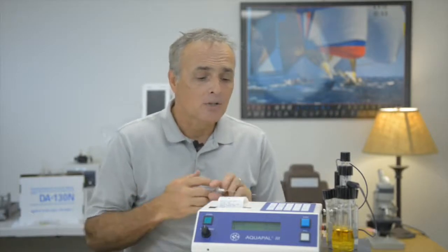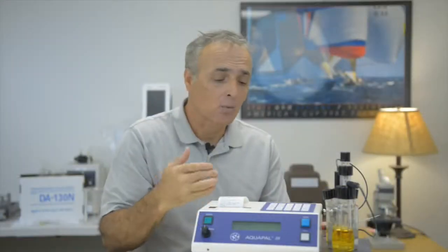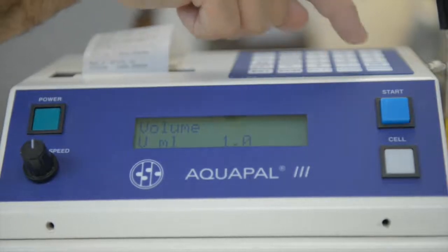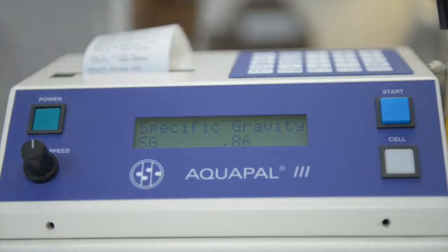Okay, so we're going to actually run a test, and so here we go. On our first test, we're going to press ppm to tell it we want our result in ppm. We're going to press the V over SG button, so that we're telling it that we're going to use specific gravity and volume. The first thing it's going to ask for is our volume, and I'm going to do 1 mil. So I'm going to press 1 and press enter. And then it's going to prompt me for the specific gravity. Petroleum generally is 0.86, so I'm going to enter 0.86 and press the enter button. Now the instrument's ready to go.